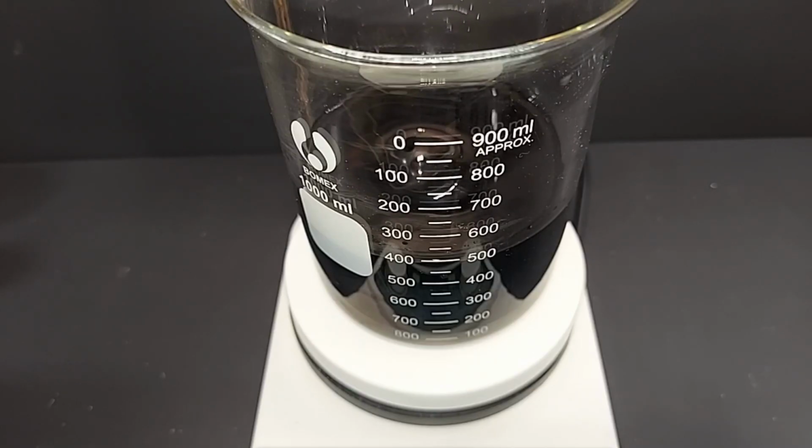Now it's cooled down, but I think in the interim we lost a lot of hydrogen peroxide, which means we have probably an excess of hydrochloric acid in there, and that's why this is so concentrated, because with the excess chlorine atoms it starts to form other copper complexes, one of which is polymeric chlorocuprates. Now there's probably some copper(II) chloride in there, I'm sure of it. There might be a little copper(I) chloride in there, but I think these complexes are really what's causing this to turn this brownish color.